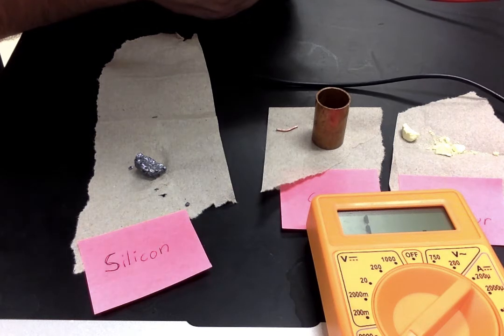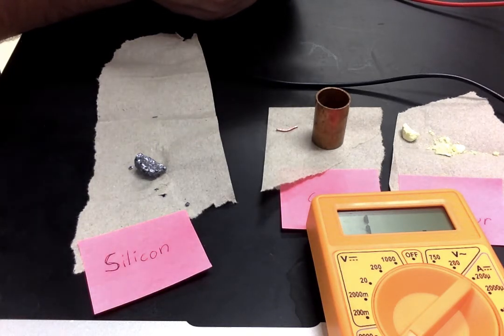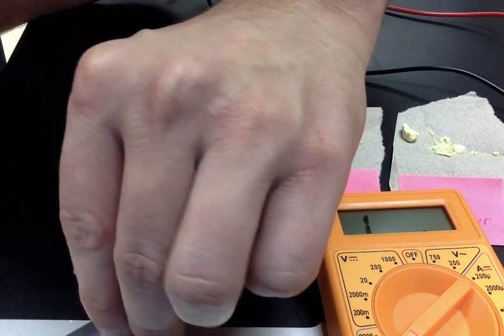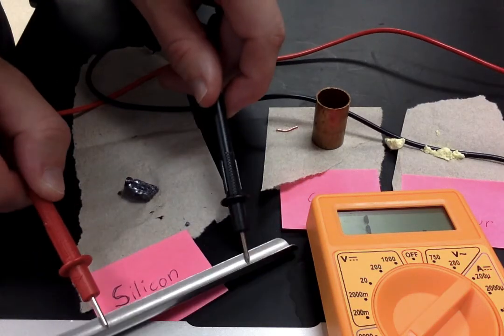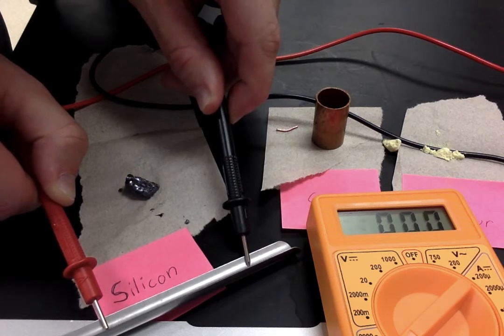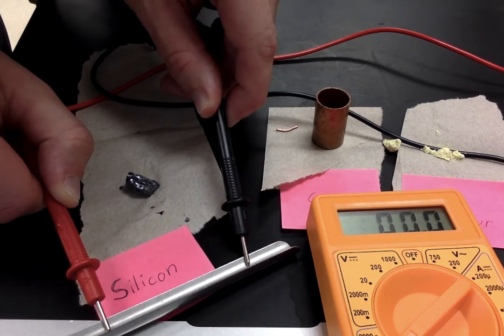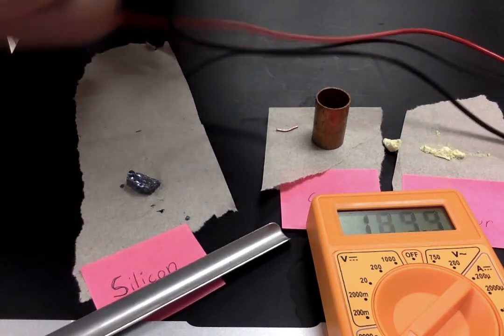So when it's reading 1, that means it's not conducting electricity at all. But otherwise, when you get a reading on here, let me show you what it looks like when we get a reading with the spatula, which conducts electricity. When you get a reading on here, you'll see a number come up. The lower that number is, the better conductor it is. So when it's giving you a reading, you're looking for a low number.